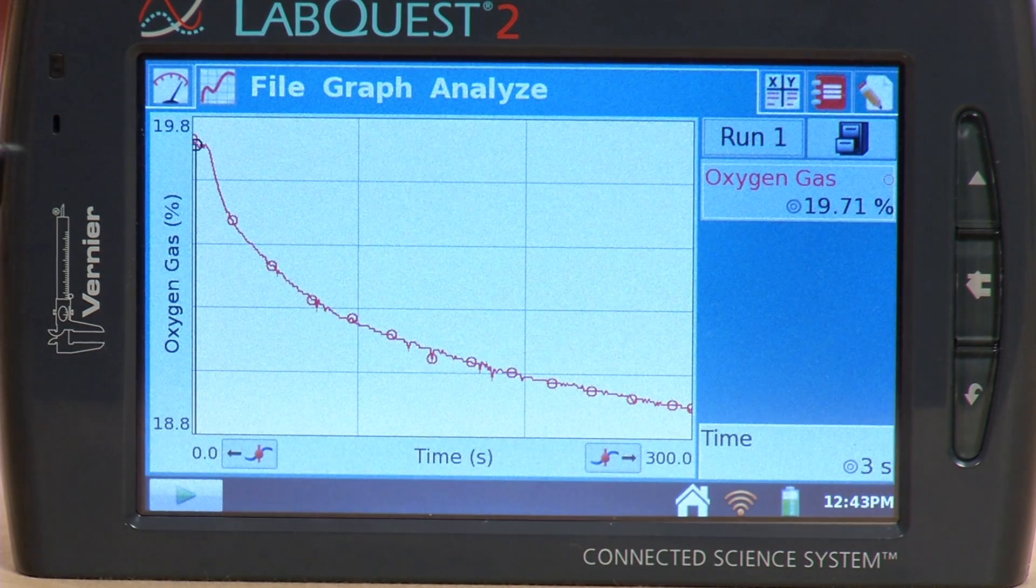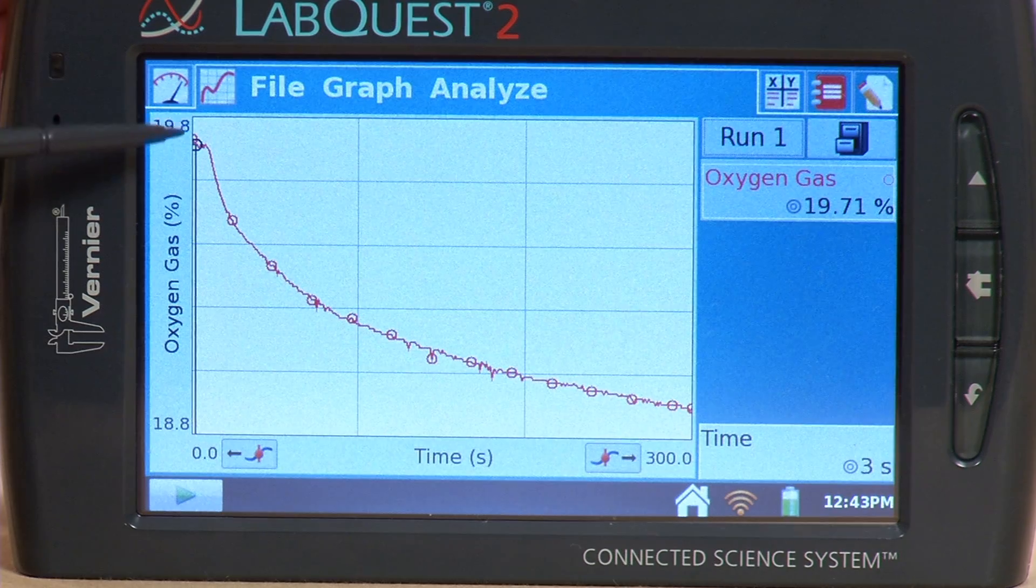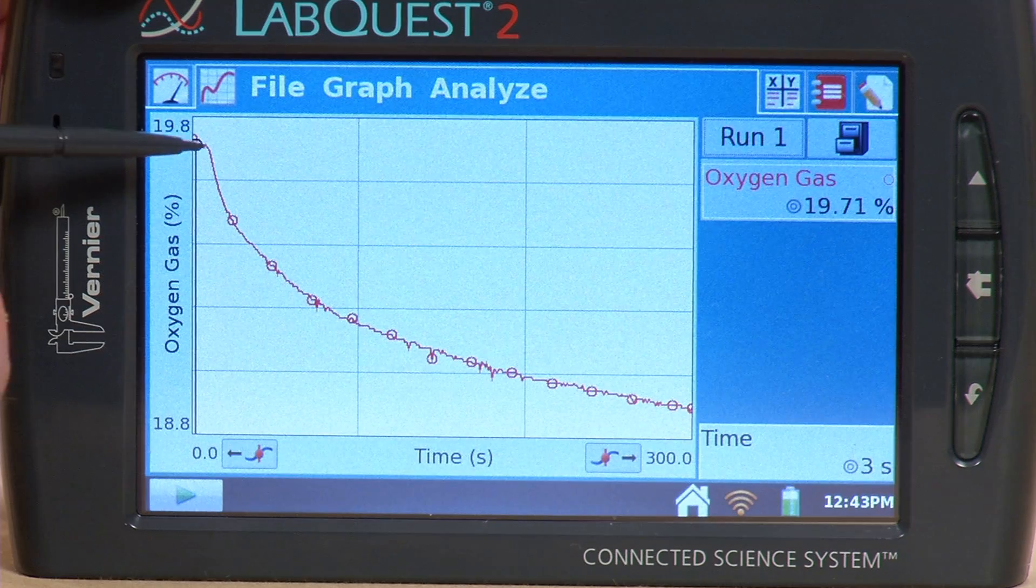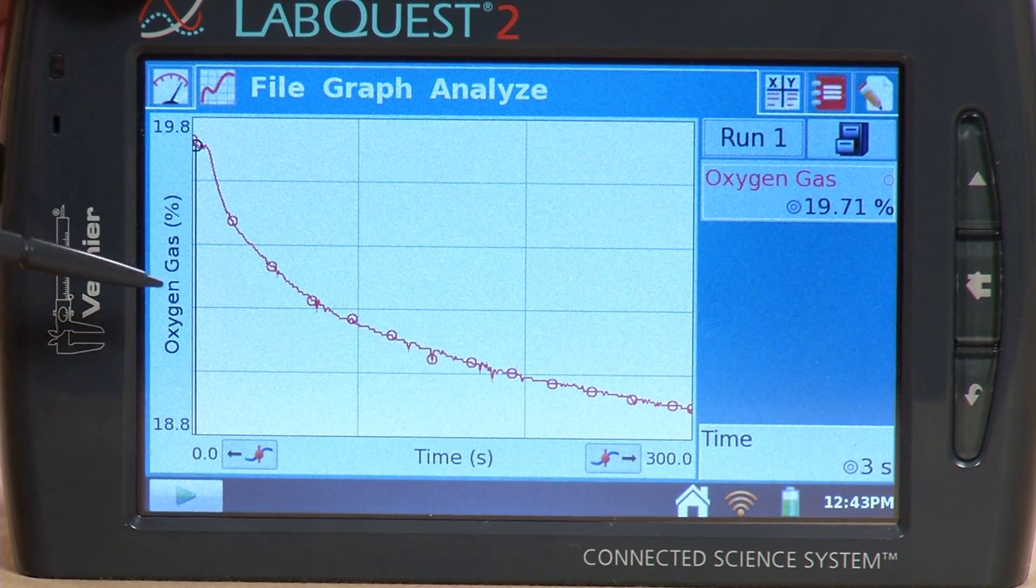we see that this first part, it dropped fairly rapidly because I just put the sensor into the bottle, and the peas had actually already been in there just a little bit. And so we saw this drop there.